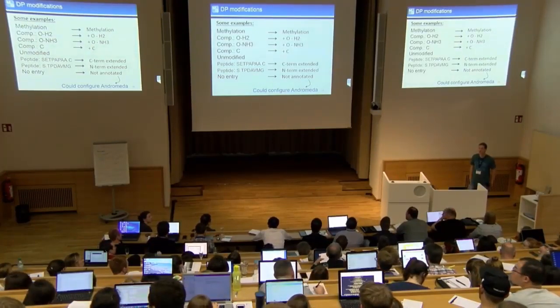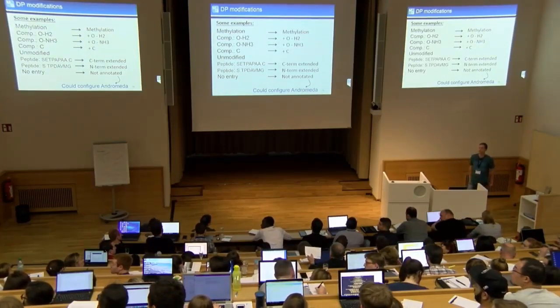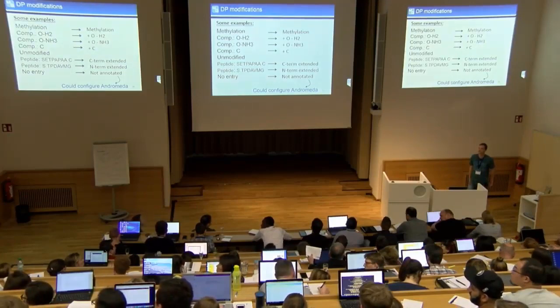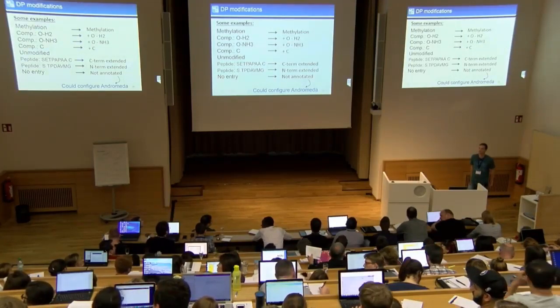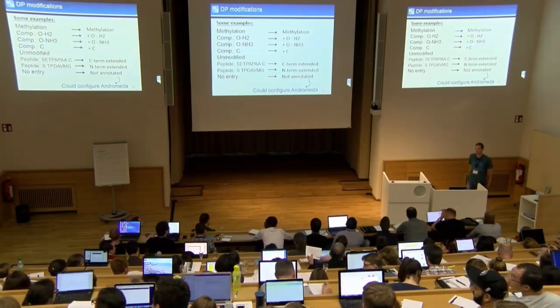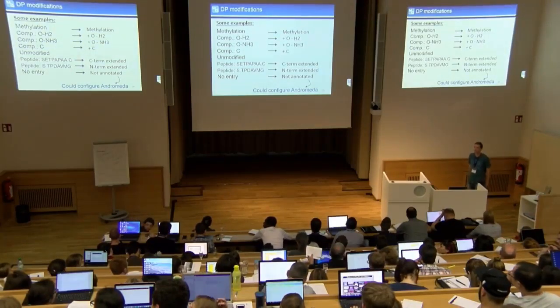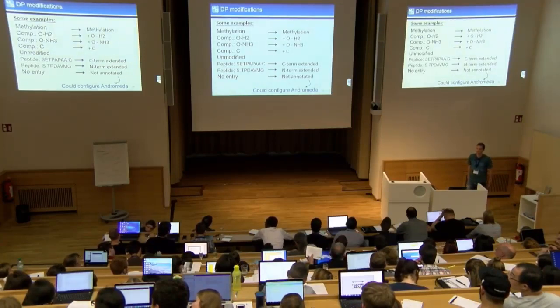Okay. And the second question is, I don't really understand because you said you have to look for the dependent peptide based on the peptides that you found already. But this new peptide will have an unknown mass shift, yes, which means all the spectrum will be shifted. So you showed us an example of a lysine modification, but out of 10 ions in the Y series, 9 of them were shifted. So how can this match to the peptide if all the spectrum is shifted?